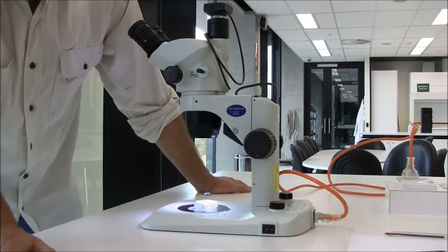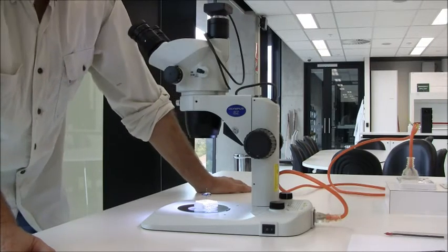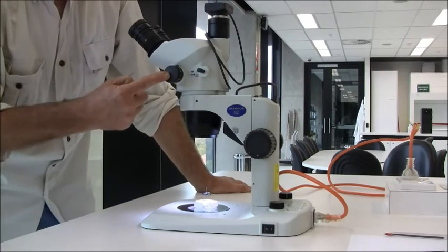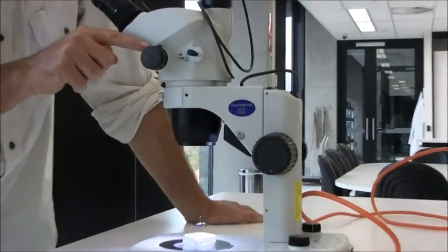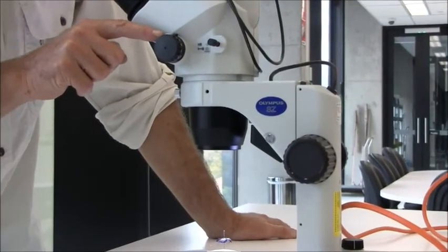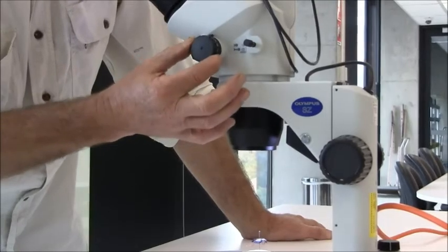Now they are quite simple. The last control that I want to show you is the magnification. Now that is generally set at its lowest value, 0.67, before you start.